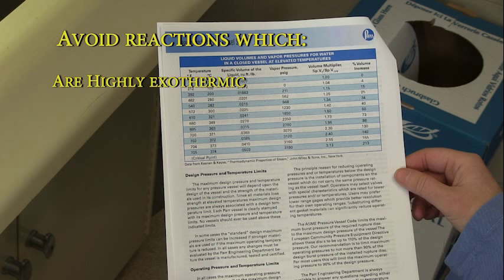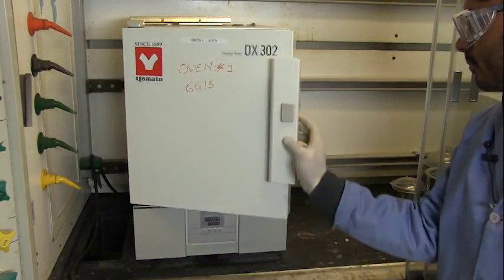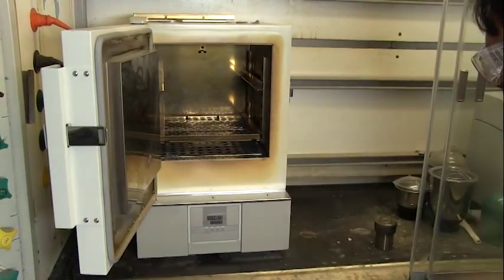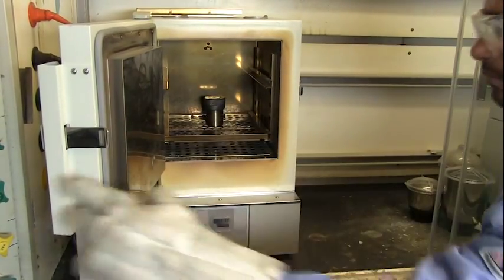Avoid reactions which are highly exothermic or which may be expected to release large volumes of gas. Heating chemicals inside a closed vessel in an oven can result in some of the highest gas or supercritical fluid pressures encountered in a laboratory.